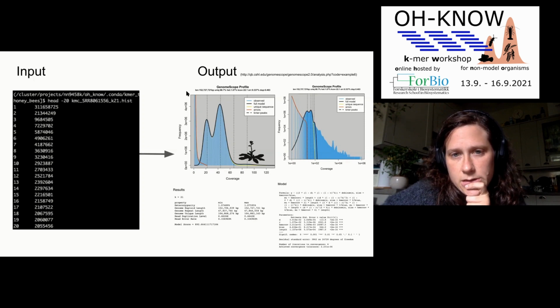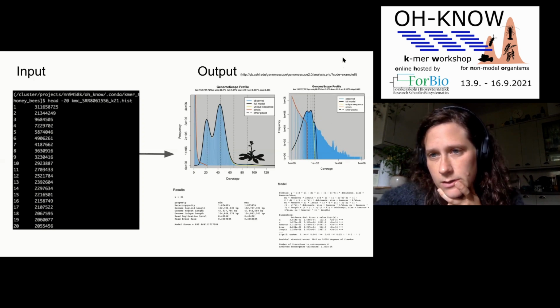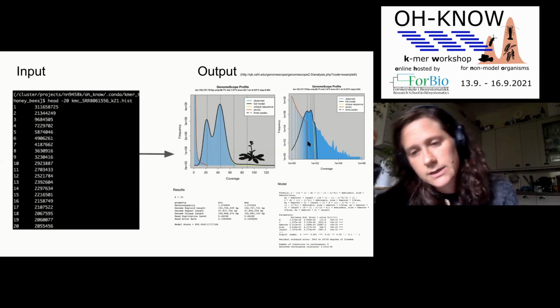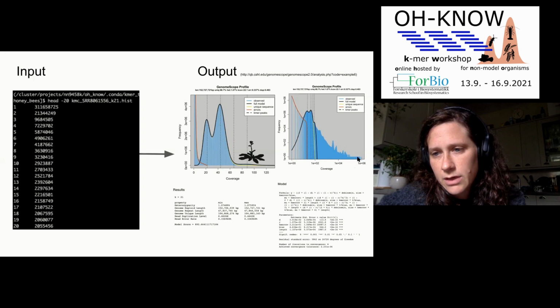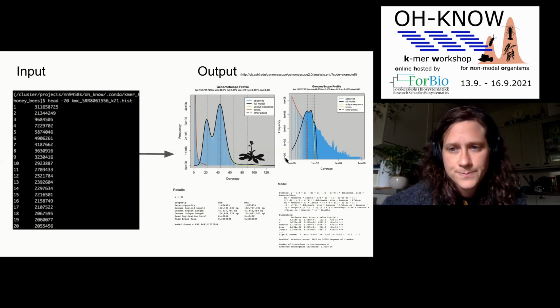The errors are fitted to the orange line. And what you can see from here, I guess you can see what I'm pointing at, is that the right spectrum is just a zoom out of the first one. So you can see here, in a logarithmic scale, the same spectra just zoomed out. And so, as you can see here, the different peaks of really, really high coverage, which I think is really cool too, and where your model is fitting inside of that.